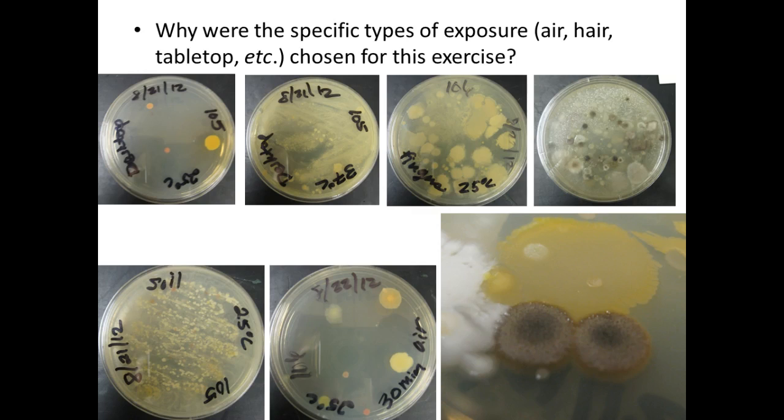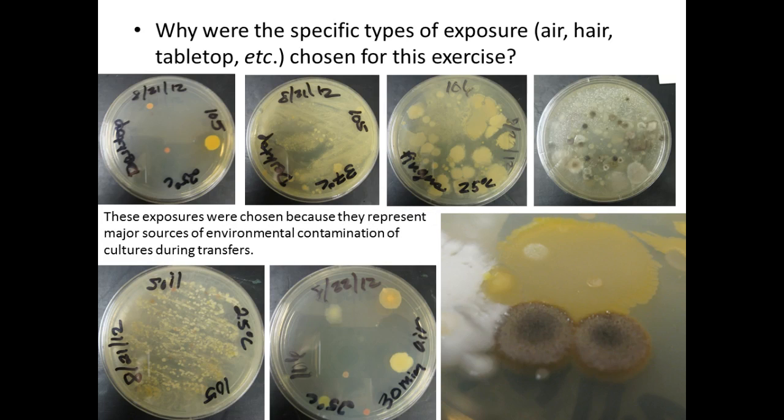So like I said, your nose is your filter. It's continually filtering the ones in the air. And then, of course, you have ones associated with your mouth. So we wanted to demonstrate to you that these organisms are present even though you don't see them, and they are sources of contamination when we start working with our cultures and want to keep them from being contaminated.